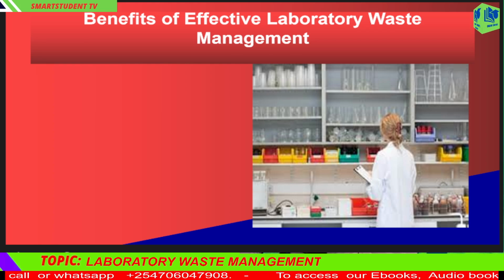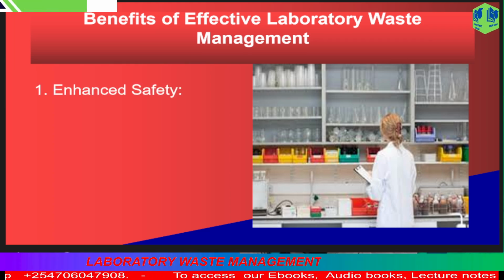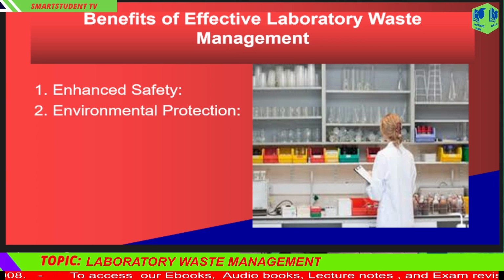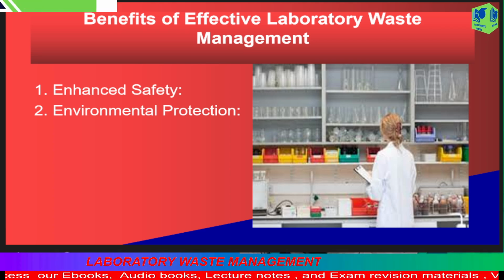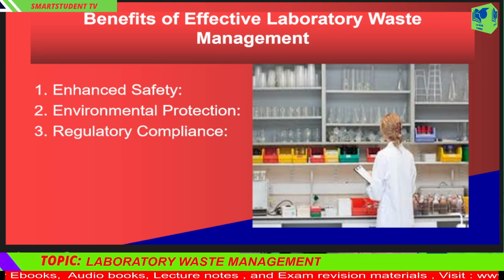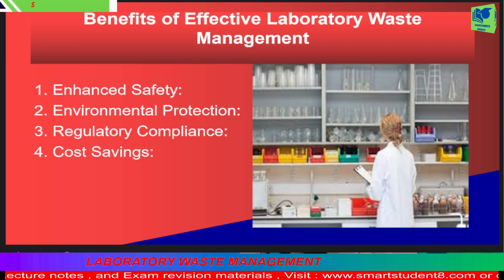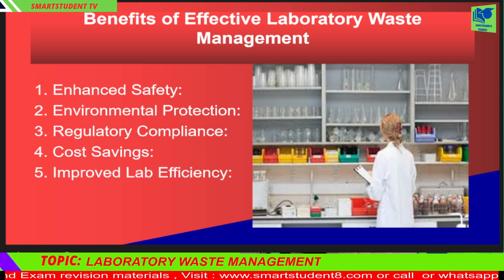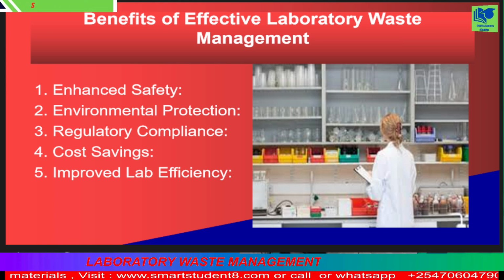Some key benefits include: 1. Enhanced safety, reduced risk of chemical spills, infections, and physical injuries. 2. Environmental protection, prevention of toxic chemical leaks into soil, water, and air. 3. Regulatory compliance, avoidance of legal penalties and reputational damage. 4. Cost savings, proper segregation and recycling can reduce waste disposal costs. 5. Improved lab efficiency. A clean and organized lab environment fosters productivity and reduces clutter.